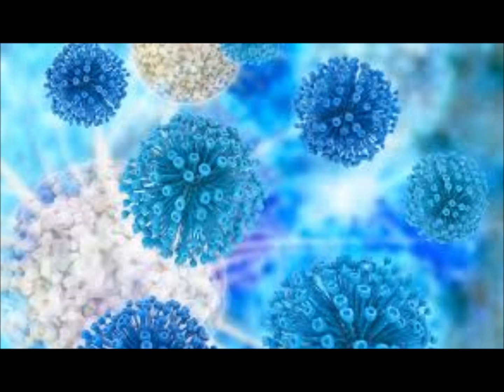Uh-oh, I might have that diarrhea caused because of Shigella or Salmonella. E. coli is a lactose fermenter. So that already eliminates a lot of normal flora if you get a lactose fermenter growing heavily on the plate. So avoiding normal flora is a big deal with your collection.